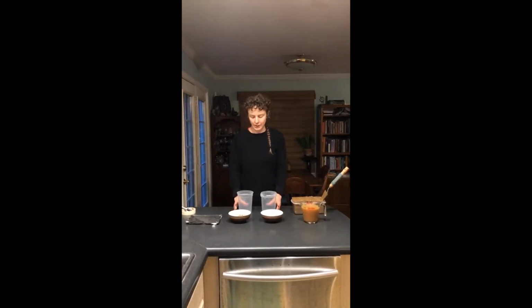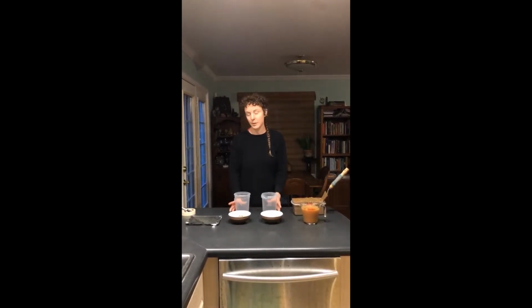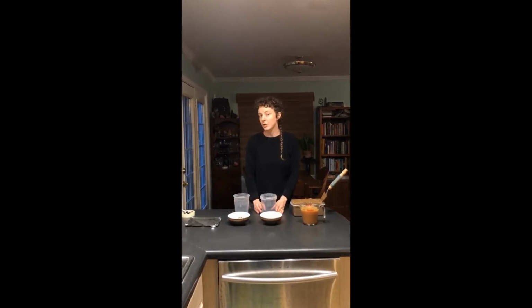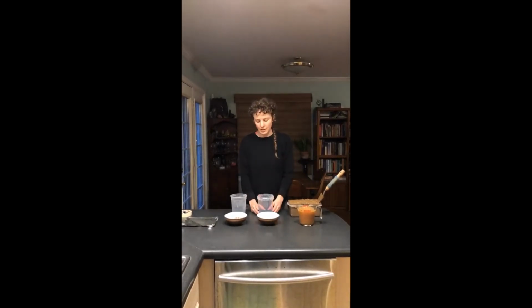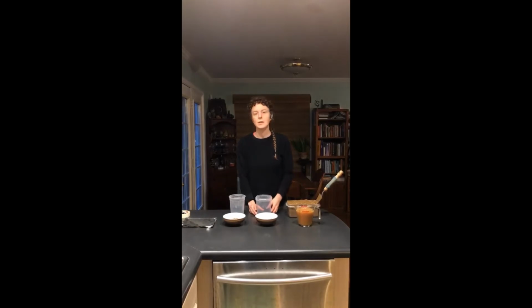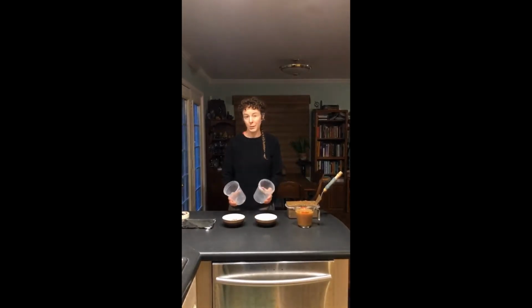Now we're going to talk about the things that you'll need to assemble your Winogradsky columns. First, for the container for the column itself, I have two plastic quart containers because we're going to make two columns. You could use a plastic jar, or a 2-liter soda bottle with the top cut off. You could use a plastic water bottle, but it might be a little harder to get the mud in, so you might need to use a funnel and might have to thin your mud down. That's why I used something with a wide mouth.